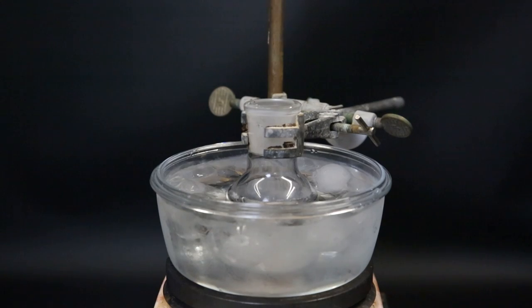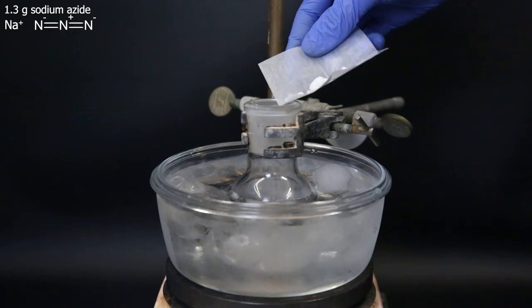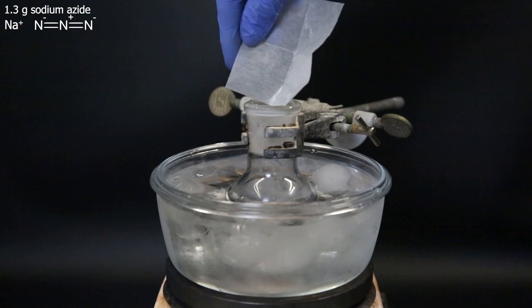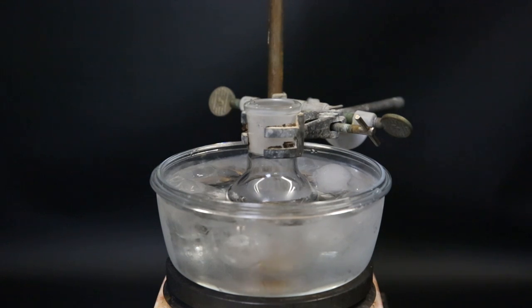I let it stir for a bit and then I add 1.3g of sodium azide. Now that everything has been added, I leave it to stir for 4 hours and allow it to come back to room temperature.